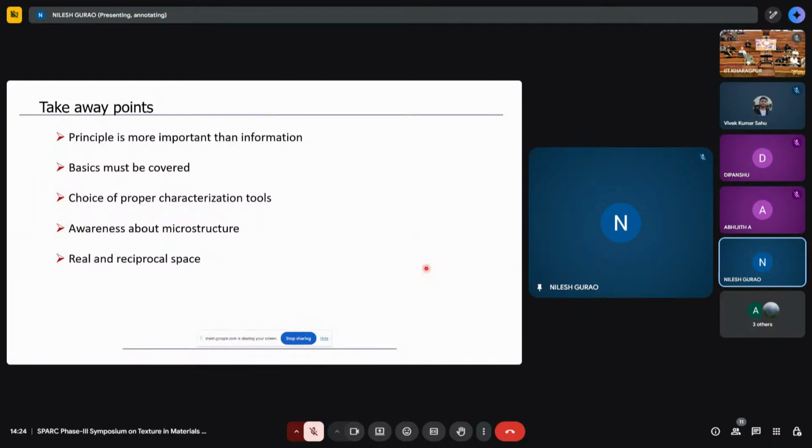Tell me. Some other student should answer now. What are the two kinds of images that we can get in a scanning electron microscope? Sir, band contrast and... Arre baba, we asked an SEM question. You have mucked up the answer for EBSD. I am talking about simple scanning electron microscope.